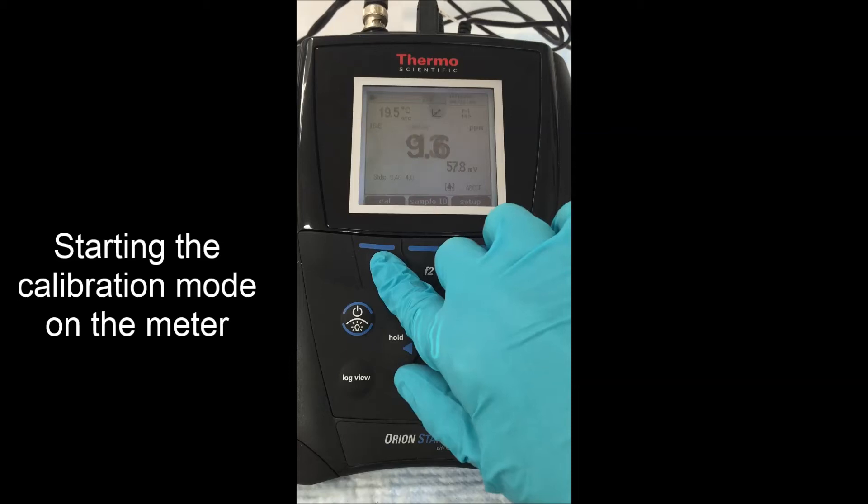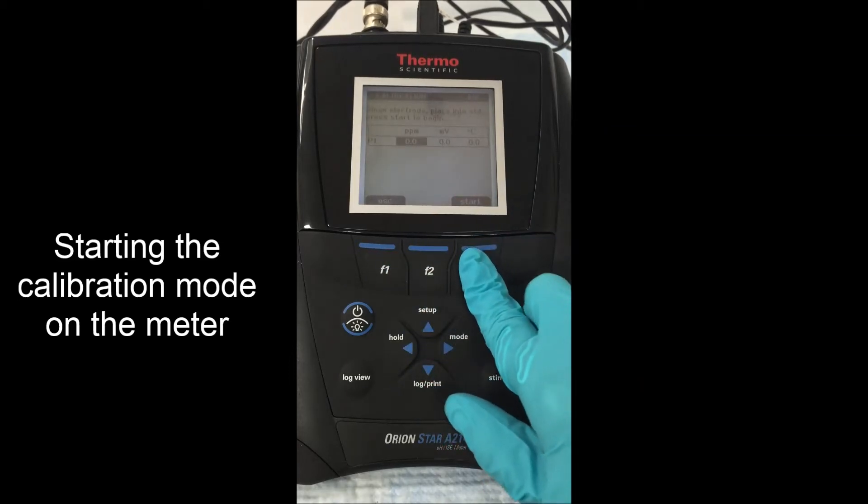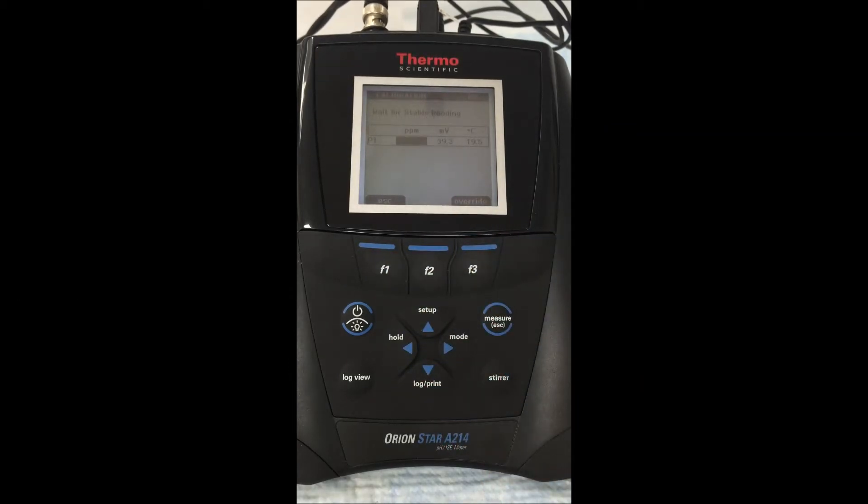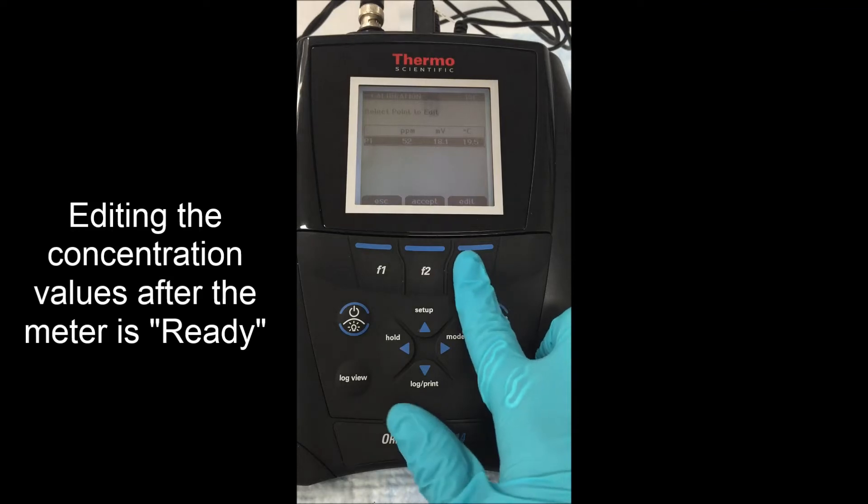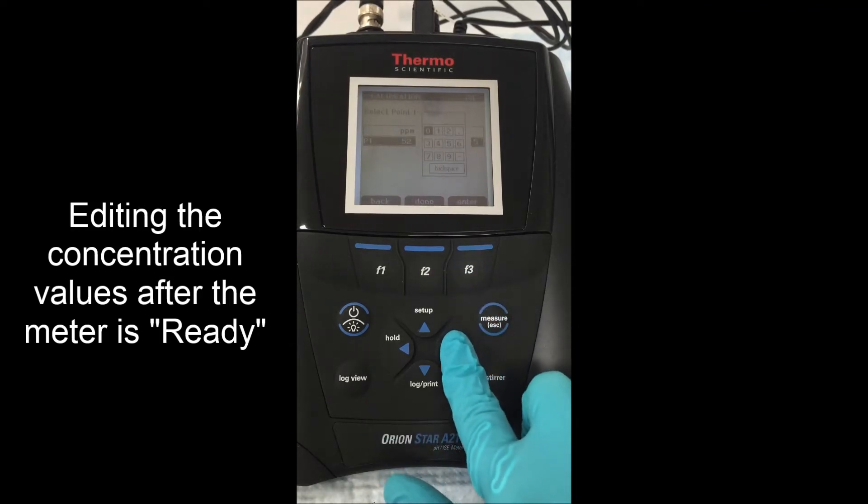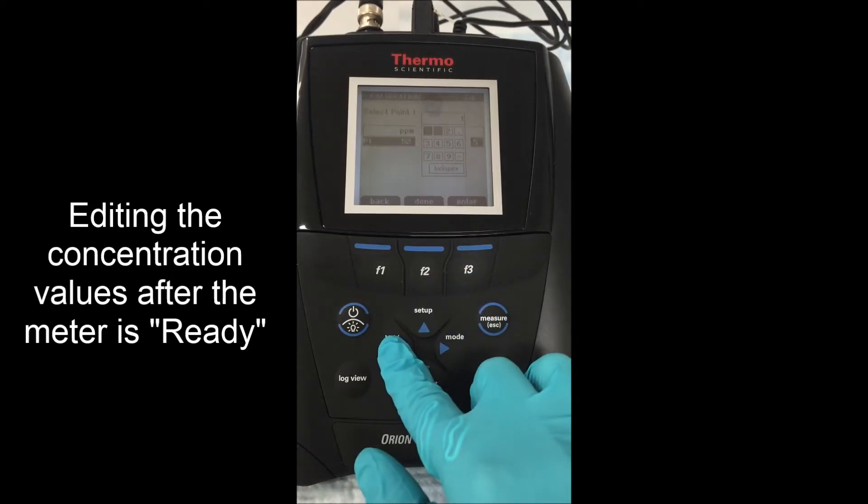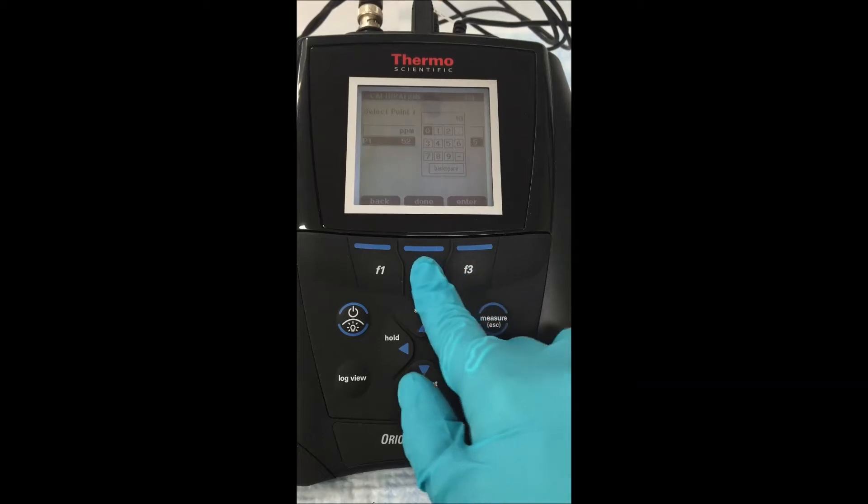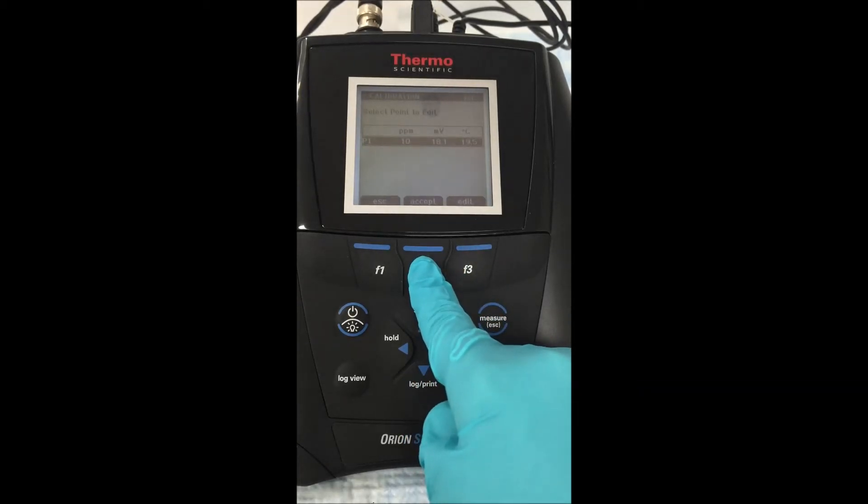Moving on to the meter, you want to start your calibration by hitting F1 to start the calibration mode. Hit enter when you're ready and the meter will start the calibration. Once the meter has started the calibration procedure and it locks onto a value, it will register as ready. Go ahead and edit that value to enter in that 10 part per million solution that we are testing. Save and on to the next point.